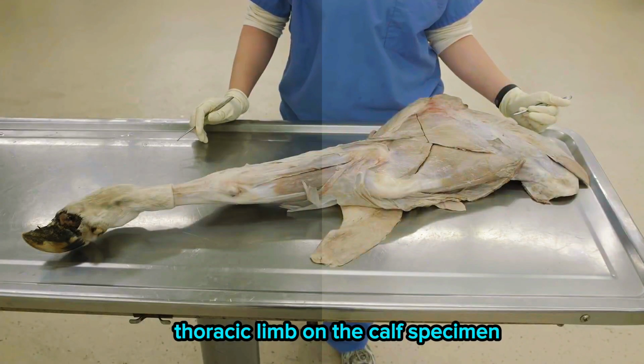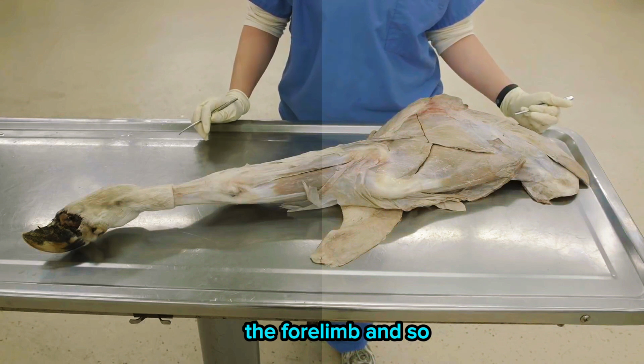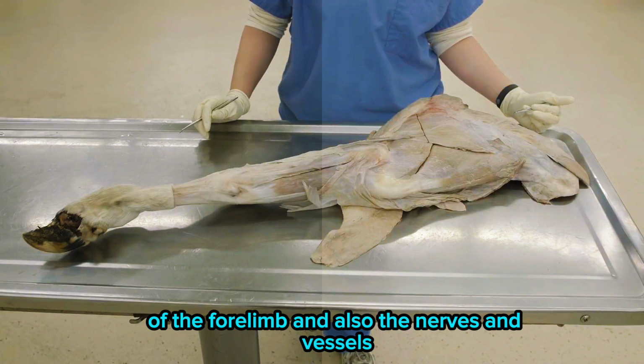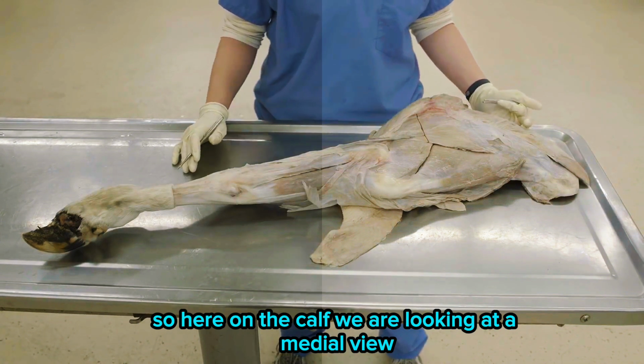The thoracic limb on the calf specimen, this is the detached left leg, the forelimb. And so we'll be looking at the structures of the intrinsic muscles of the forelimb and also the nerves and vessels. So here on the calf, we are looking at a medial view.